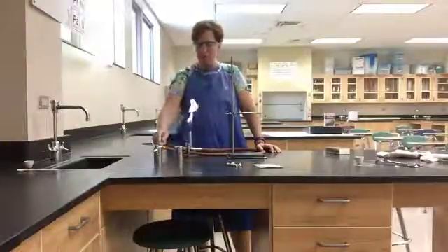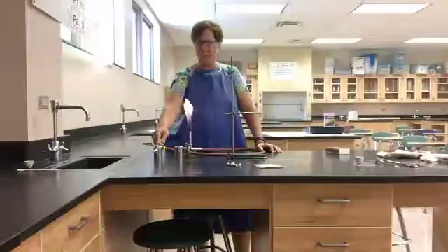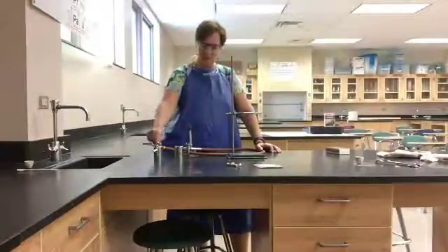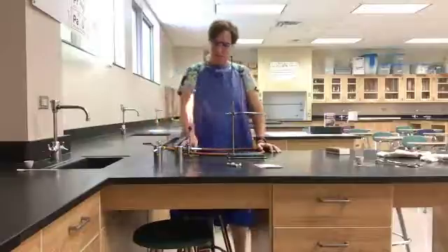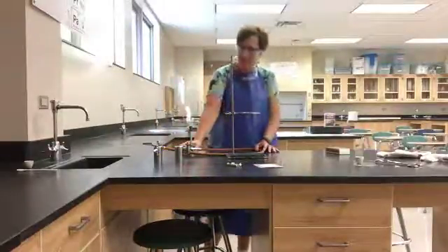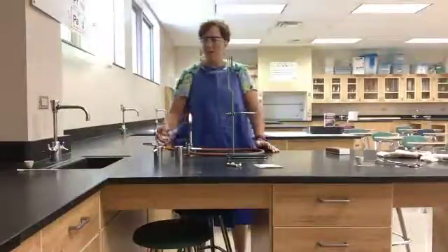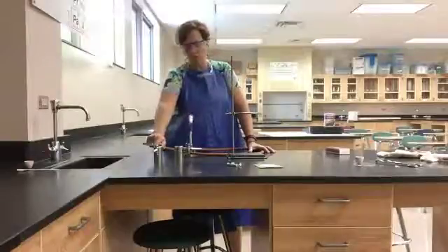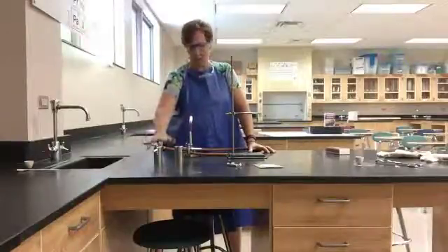If the flame is a little too high, you can adjust the height either at the bench with the nozzle, or with your fine gas adjustment — the fine gas adjustment moves it only a very little. If you need to put the flame out right away quickly, always do it at the bench, at the big nozzle.